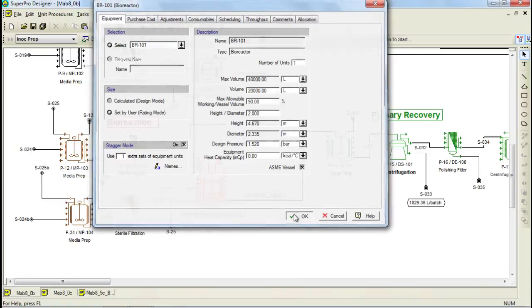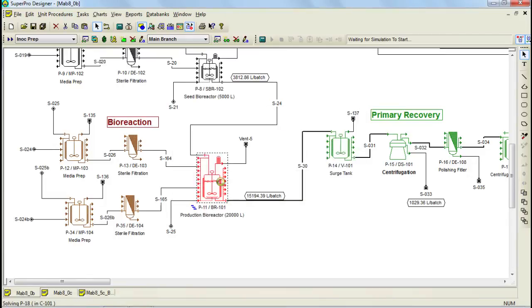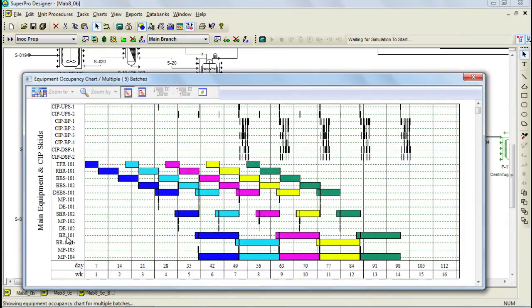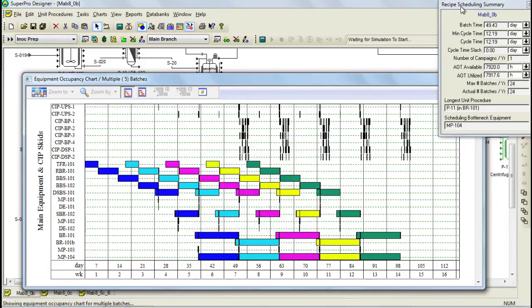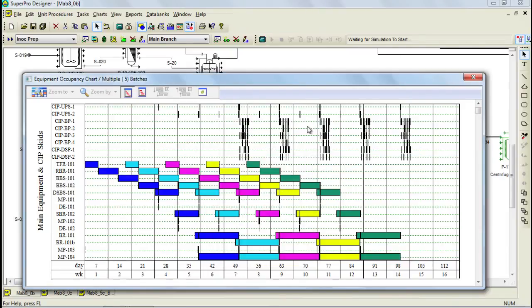Let's now generate the new equipment occupancy chart to see the differences. You can now see through this chart that there is an extra piece of equipment called Bioreactor 101B. If we bring up the Scheduling Summary, we'll see that the cycle time has now been reduced to 12.19 days instead of 14 days. Even though adding this extra bioreactor had a positive impact, we can also see that a new bottleneck has been created. It's important to mention that when debottlenecking a facility, the extra pieces of equipment should be introduced to the scheduling bottleneck. Therefore, at this point, we would need to add a new tank to further reduce the cycle time.